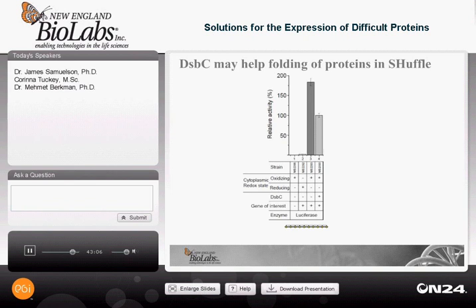In the case of this luciferase, which has multiple cysteines with unknown pattern because it hasn't been crystallized yet, we see that DsbC is actually detrimental to its folding, and we see a reduction in activity when expressed in cells that express DsbC. Another protein, urokinase, which is highly dependent on DsbC when expressed in the periplasm, does not seem to have much dependency, and we see a modest improvement in activity.